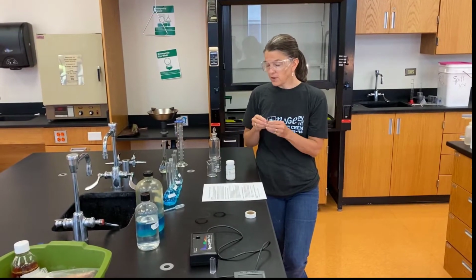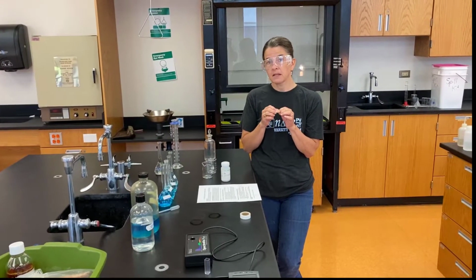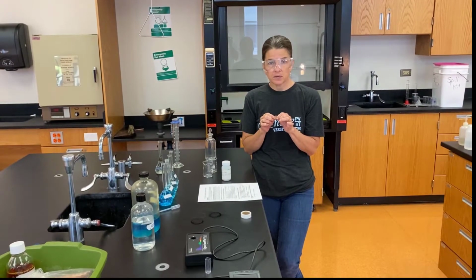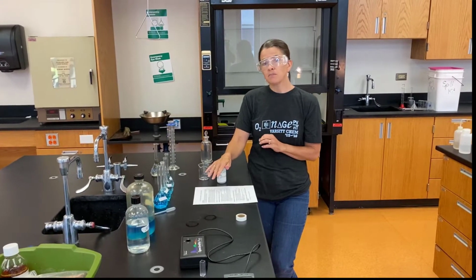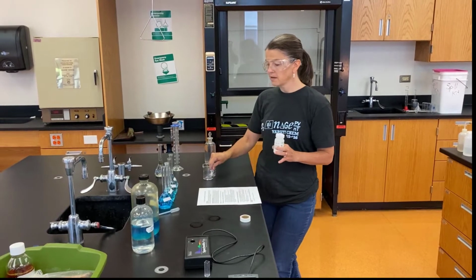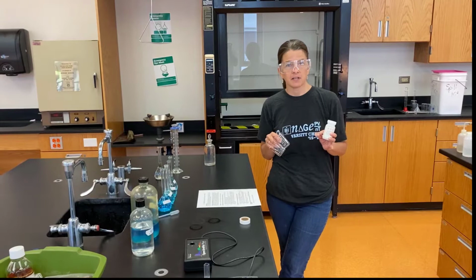Now, you actually could get on the government website and determine, since this is a penny that is made after 1982, the exact percentage you would expect. Brass can be mixed in any number of ways, so you might not know exactly what that one will be. So let's start by getting our initial masses on the analytical balance so that we can go to lots of decimal places.